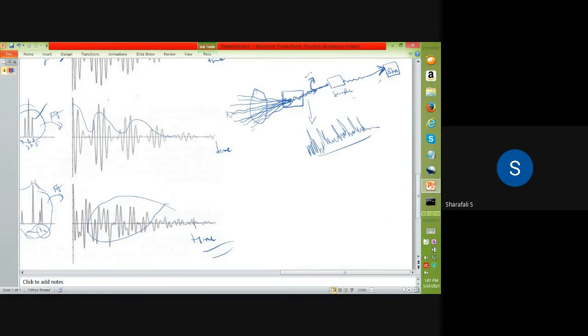So we have a complex signal that goes through the sample, and some of that frequency will be absorbed, and this one will again be some complex frequency, something like this. That will come to the system computer and be stored, and we will take the Fourier transform of this signal, and we will get a spectrum which has those frequencies. What are the frequencies present in this particular spectrum after taking that Fourier transform?